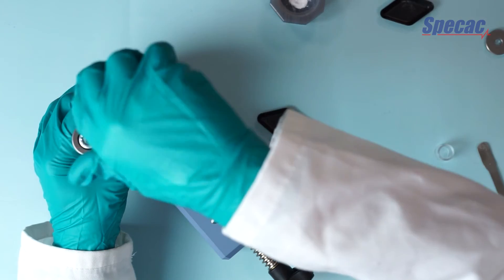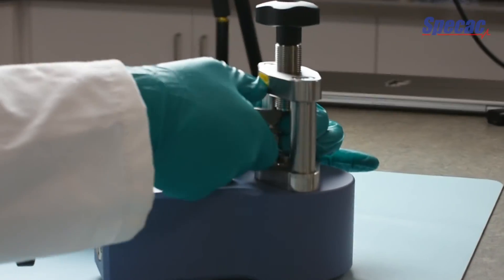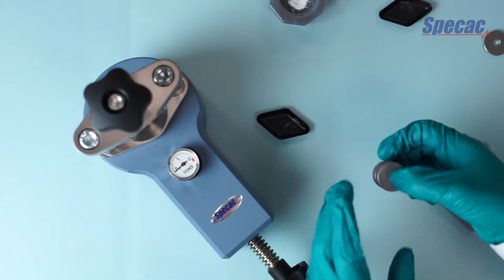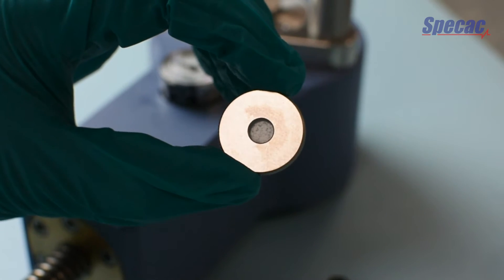We can relieve any remaining pressure using the lead screw and gently remove the pellet die assembly from the press. With a slight twisting action we can remove the top anvil and we should find the sample captured in the ring holder.